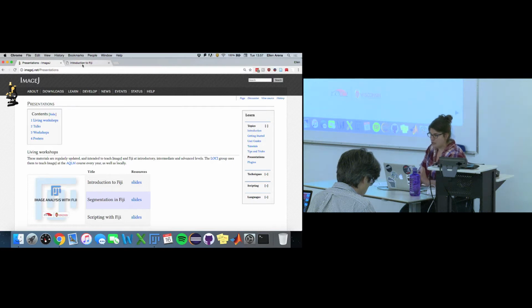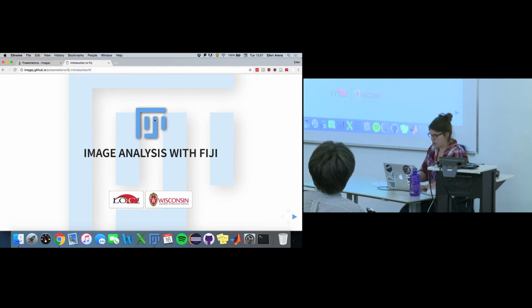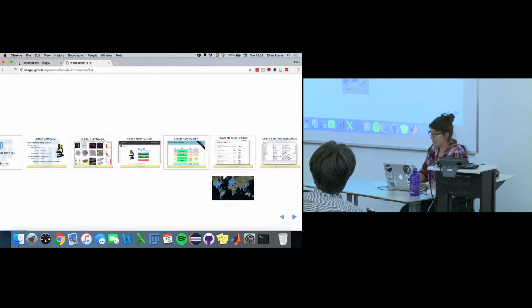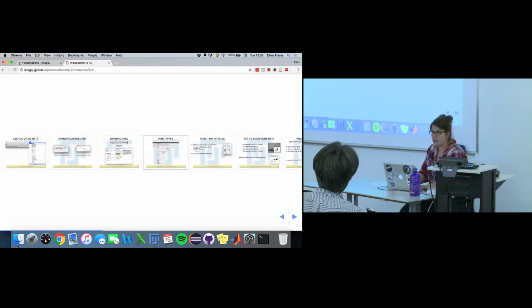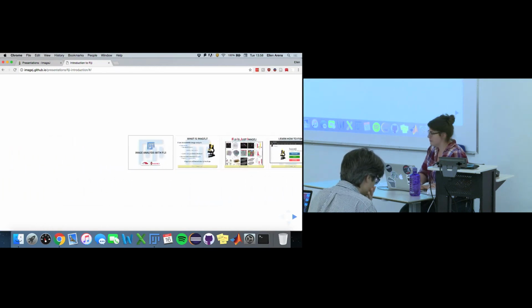These slides are in a thing called Reveal. If you get lost, you can move through them using the arrow keys or spacebar. Because they're actually two-dimensional, you can also hit Escape to see the overview, and there's one that goes down here, so they're 2D slides. If you ever get confused about finding the right slide, just hit Escape and move through with the arrow keys.